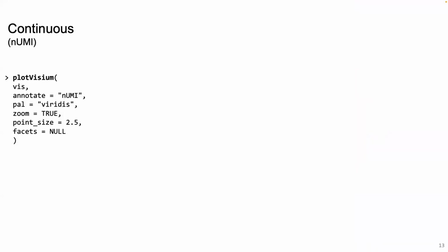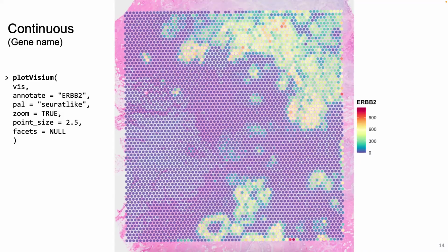On the top, I think at the previous step when we did QC, we removed them because of low counts. And here, this is by this gene ERBB2. So you can see the distribution of it, but always with one function.